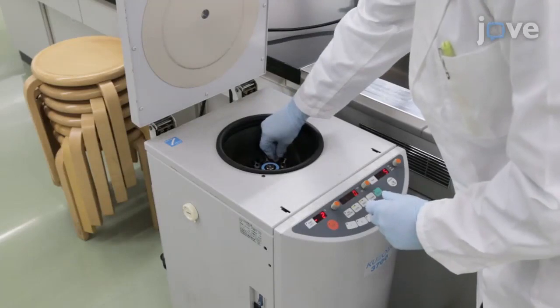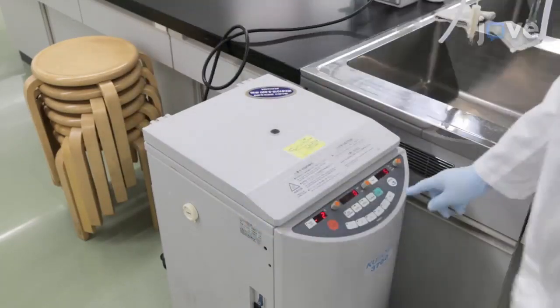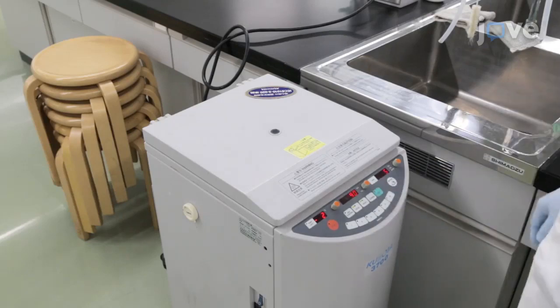Transfer 1,000 microliters of the homogenate to a 1.5 milliliter tube and centrifuge for 5 minutes at 10,000 times G at 4 degrees Celsius.